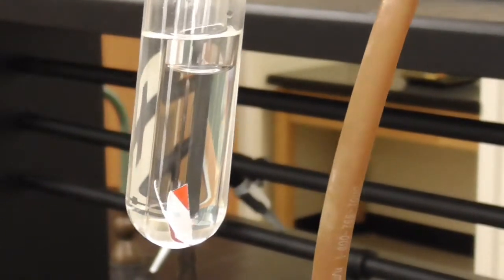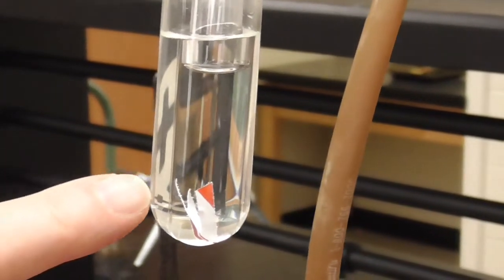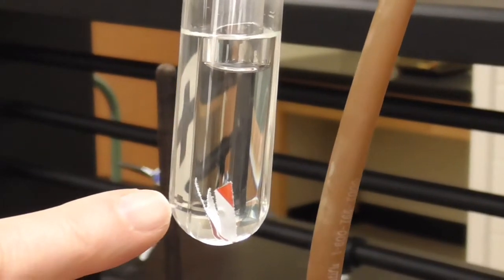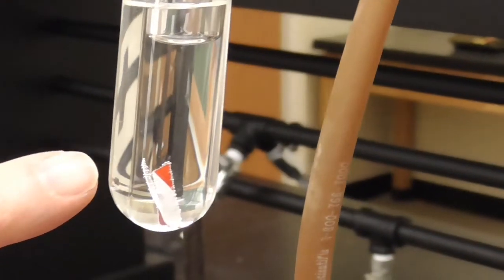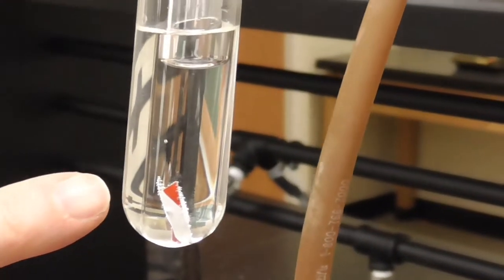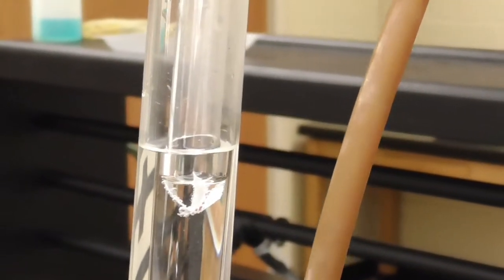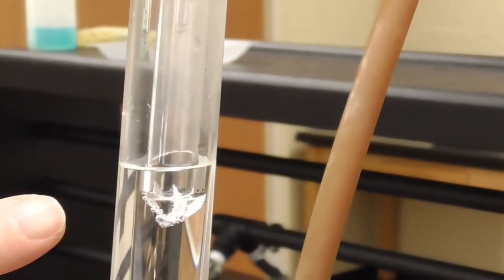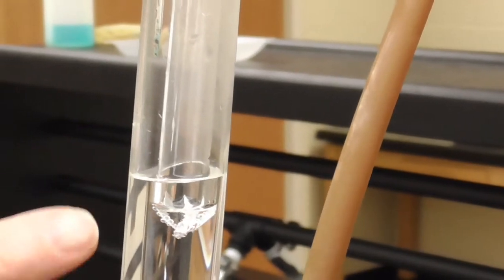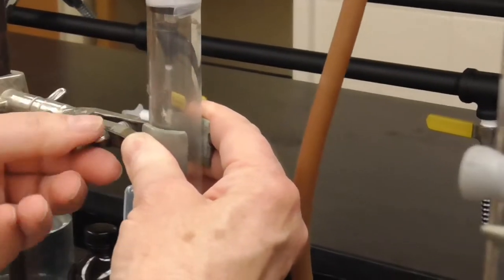Now it takes a little bit of time for the reaction to get going because the hydrochloric acid can only contact the aluminum along the cut edge there. And so in a little bit we will start to see perhaps some gas bubbles starting to form. And you might, there went one, you might be able to see now some gas bubbles starting to form along that cut edge. And in fact there's hydrogen being generated. That's why it all rose to the top, because the hydrogen gas is helping to buoy that aluminum up. So I'm just going to clamp it back in here again. There's no point in me holding it the whole time.